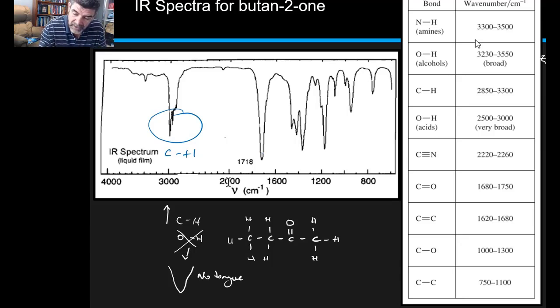We've got this really nice peak down at around 1718. What you can notice is that peak around 1718 falls beautifully into the range for our carbon double-bonded oxygen, and we definitely have one of those.